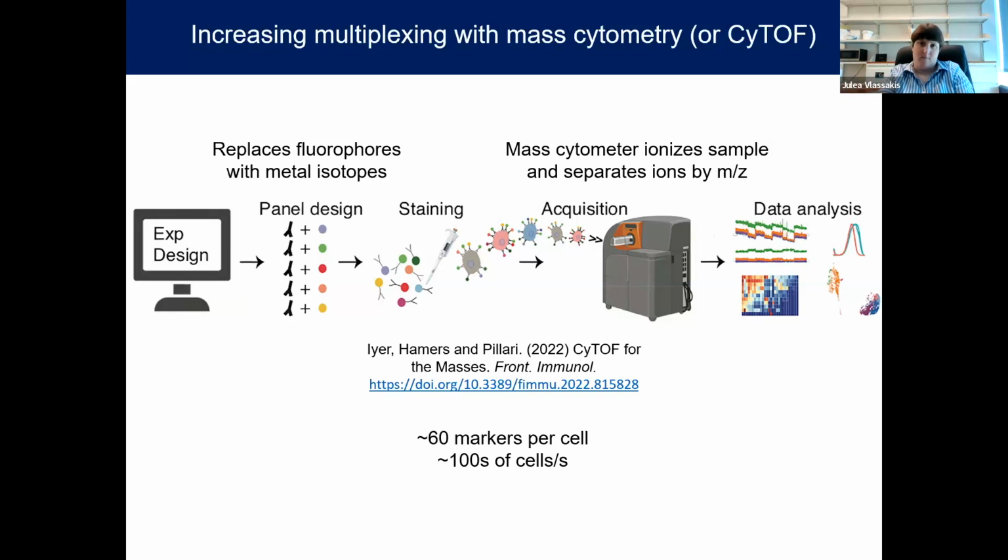It's part of why mass cytometry and CyTOF have become relatively rapidly adopted, especially in the field of immunophenotyping, especially since the work started out of Gary Nolan's lab at Stanford, and he's primarily interested in immunology. So one of those cases where the technology development occurred to be able to address specific biological questions in immunophenotyping, but has broad applicability elsewhere.